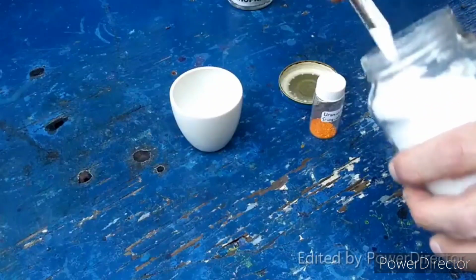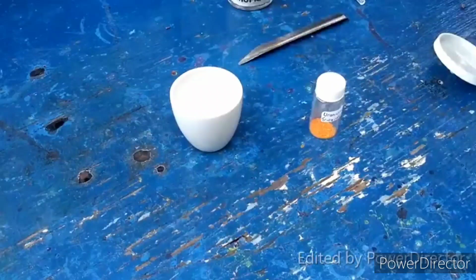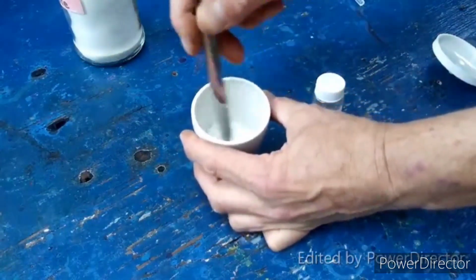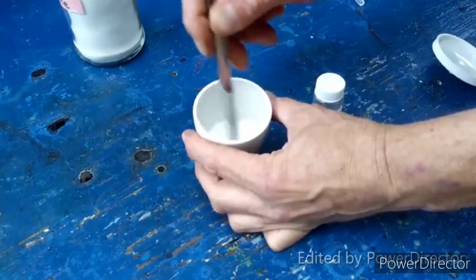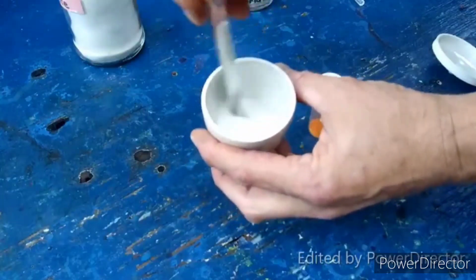Potassium nitrate may act like a flux too, to help melt the potassium chloride. Which, I mean, potassium chloride isn't super high melting. It's 770 C, if I remember right. Okay, I see, I'm just mixing it up.